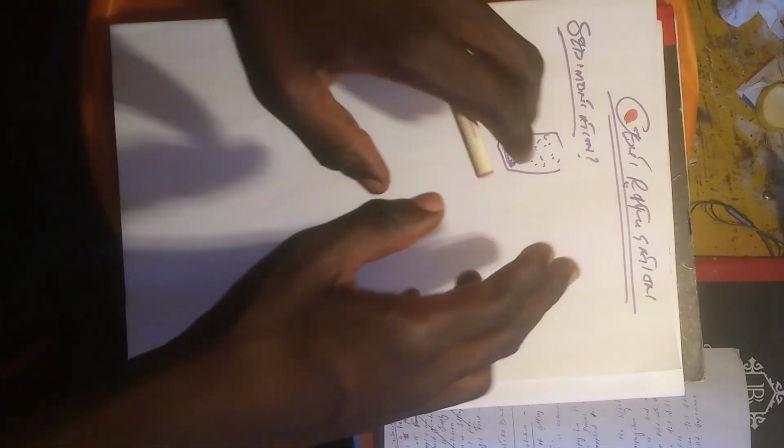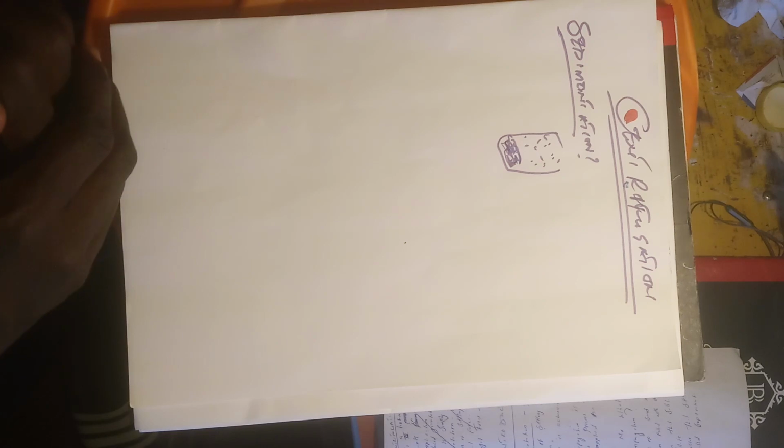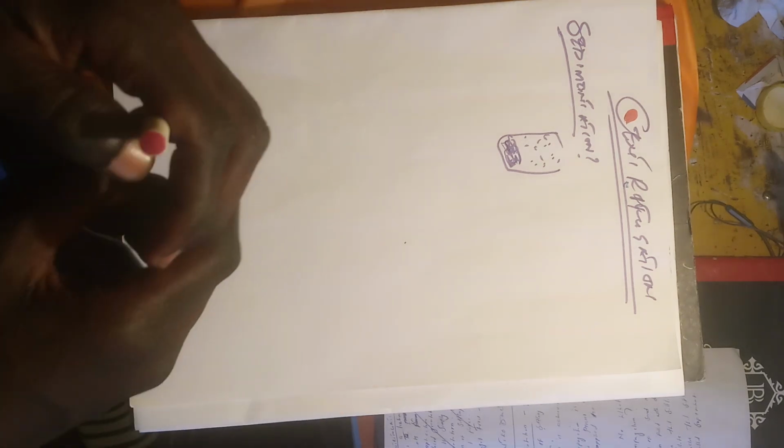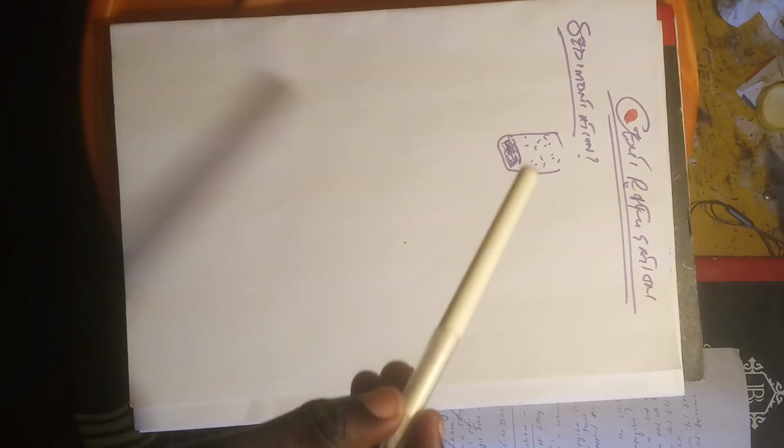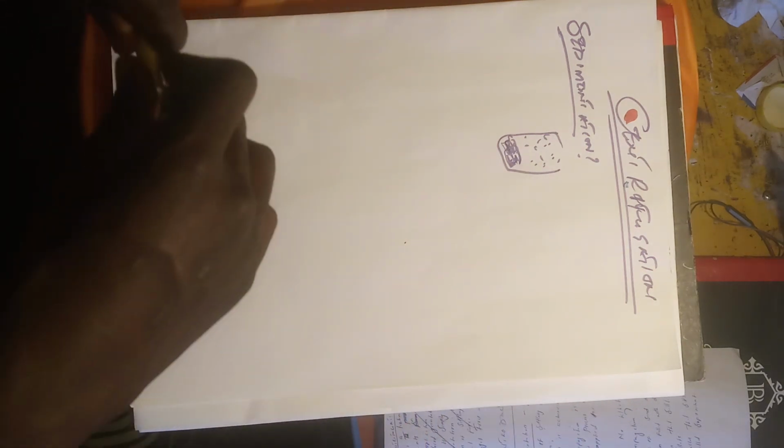So this is where centrifugation as a whole comes in, because it applies an induced gravitational field to these liquid suspensions.